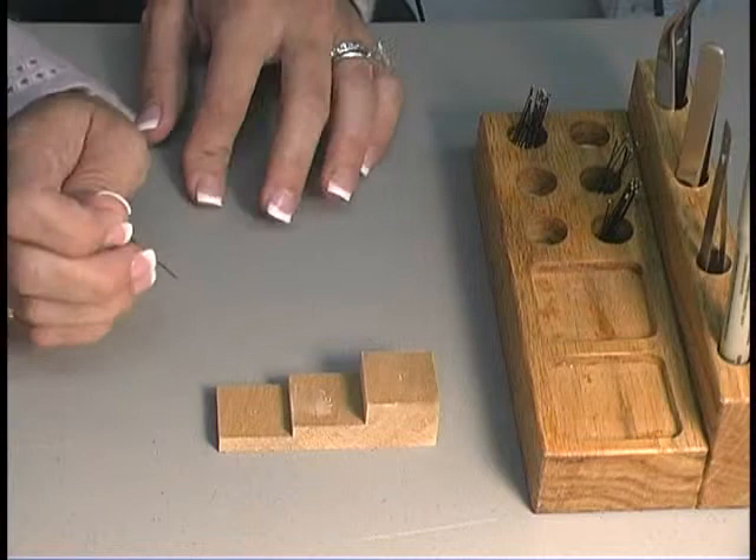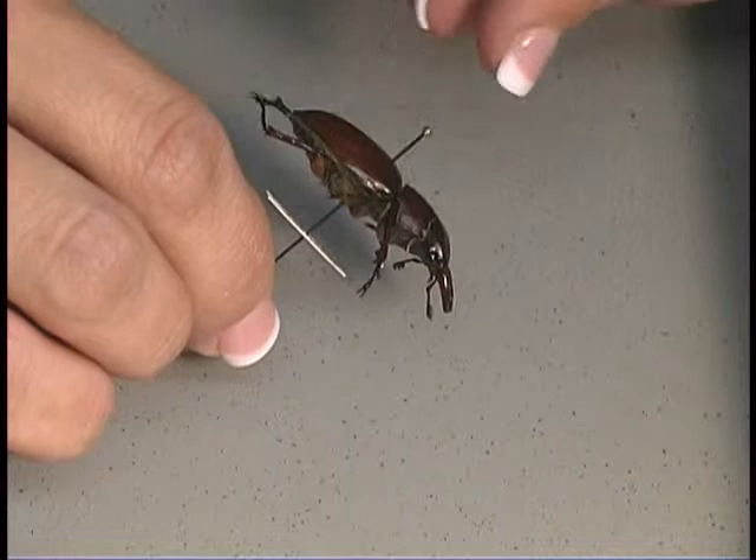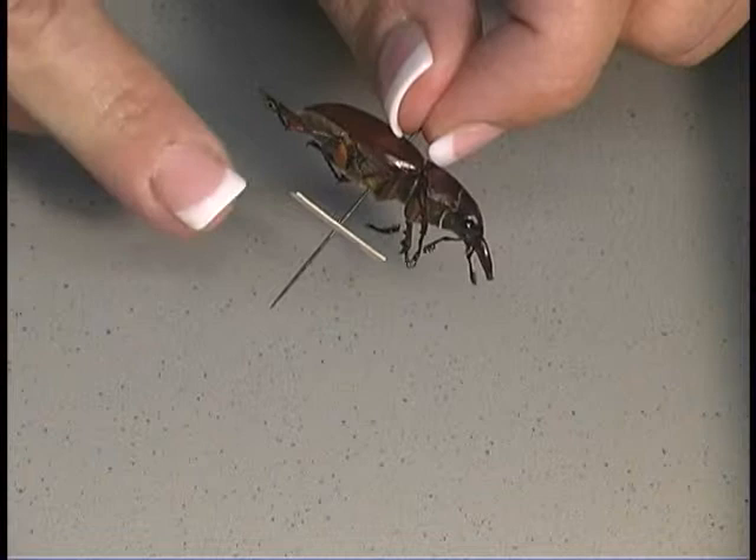Insect pins are going to be longer than normal sewing pins to allow for easy handling. As you can see here, there's enough room for two fingers to be placed at the top of the pin so you do not damage the insect specimen, and also there's enough room for the label to be placed underneath the insect specimen.